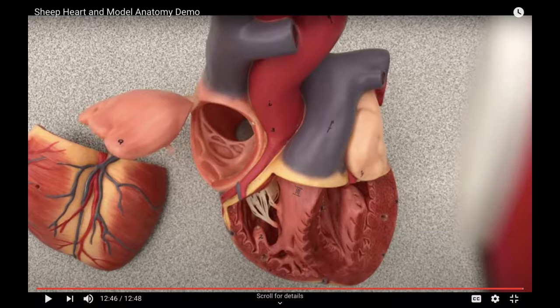For example, the chambers, the papillary muscle, the chorda tendineae, the valves, and the branches of the coronary artery, where is the aorta, the pulmonary trunk, superior and inferior vena cava. All of them are the same in human and sheep heart. Just the difference, which I mentioned for you, is the branches of aortic arch.